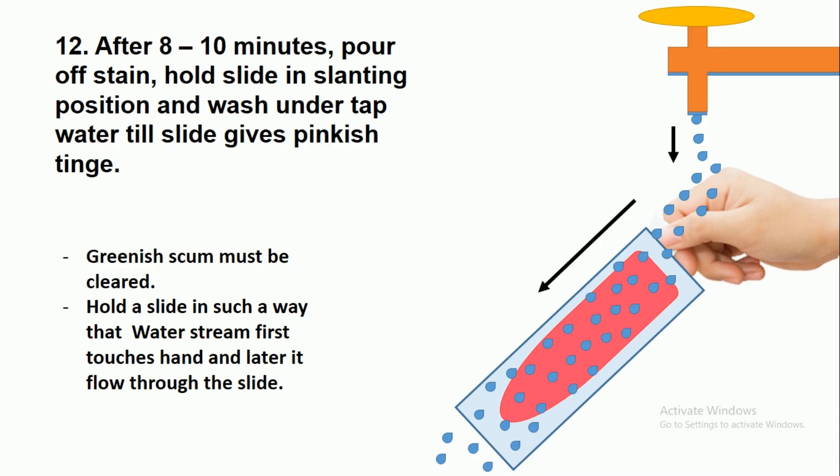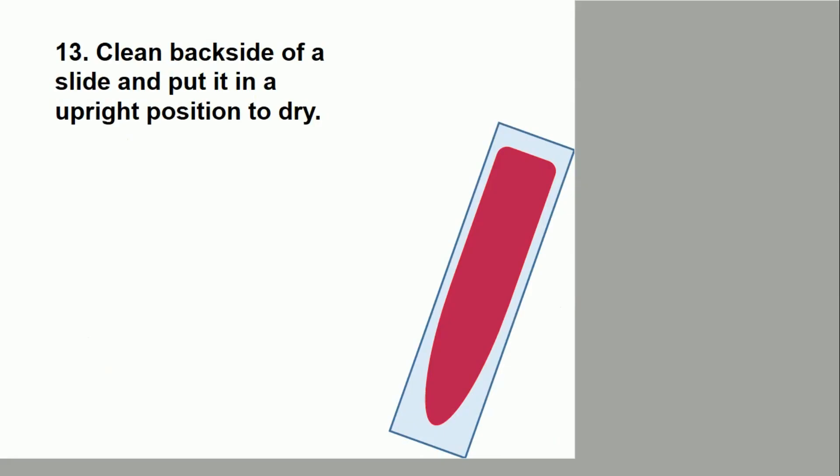After eight to ten minutes, pour off the stain. Hold the slide in a slanting position as shown in the figure and wash under tap water until the slide gives a pinkish tint. Hold the slide so that the water stream first touches your hand and then flows across the slide. Clean the back side of the slide and put it in an upright position to dry.